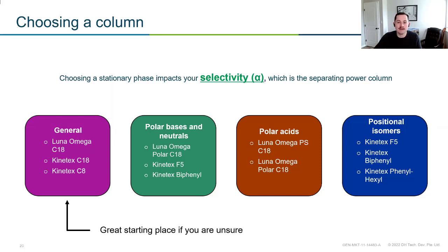You're going to get an idea of what's retaining, what's not retaining. You can even start to experiment with some mobile phases. And then if you need to, go ahead and do some optimization on your stationary phase later, or you might say this is just acceptable.